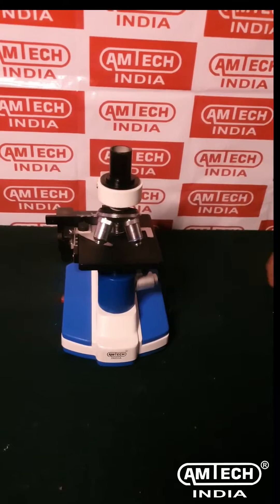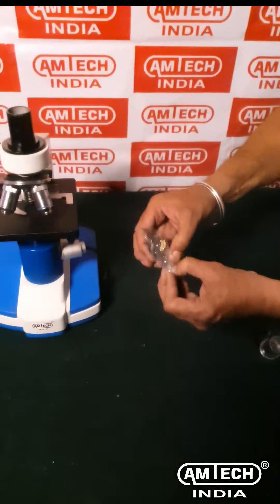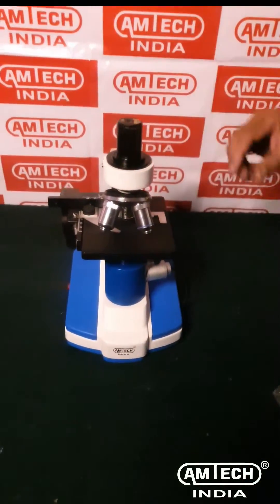Take out the dust cap from the microscope tube. Now insert the microscope eyepiece into the tube.